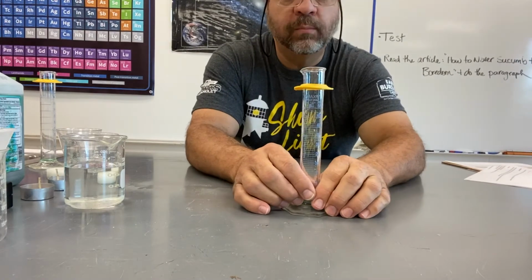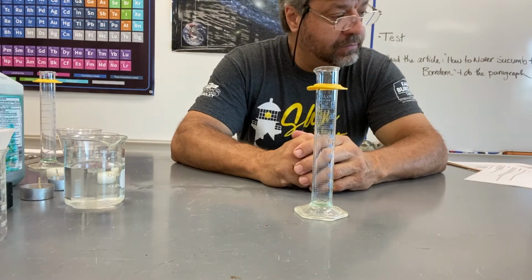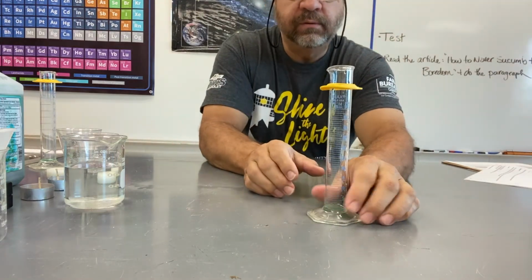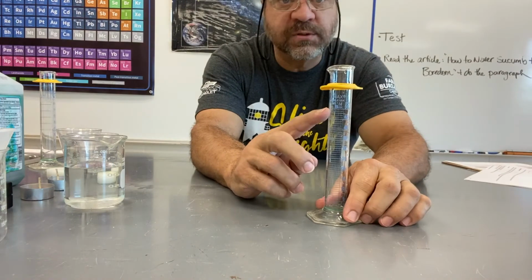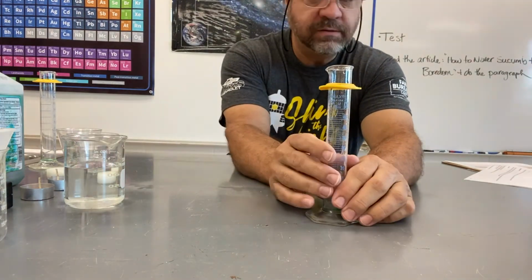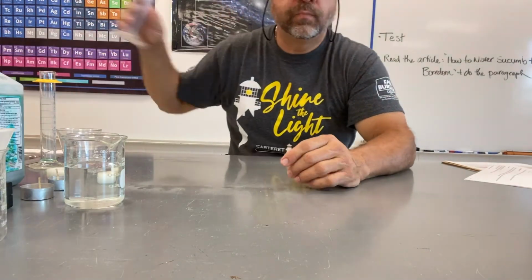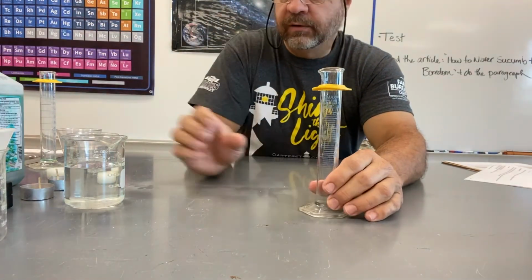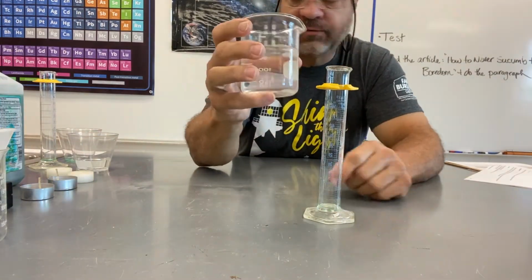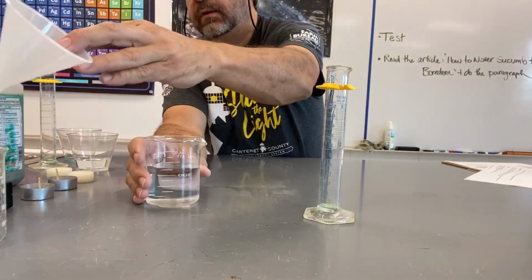All right, guys, we're back with another one of our demonstration labs looking at the densities of liquids. And we have our graduated cylinder here. Again, this is our fairly small one, only goes up to 50 milliliters. And we're going to make a density column, this is called. Let me just shake some of that liquid out of there. All right, so I'm gonna start off with just some tap water. I'll turn this so I can see it.